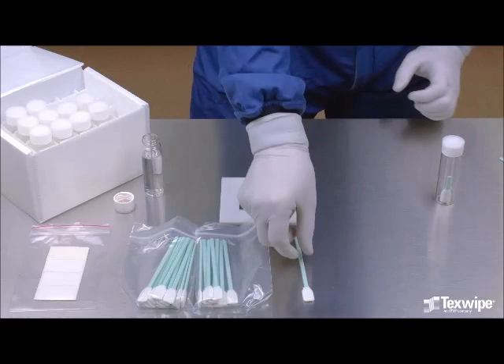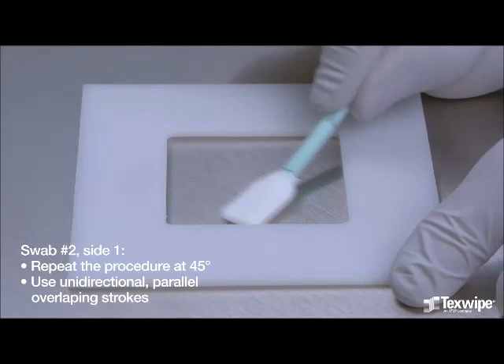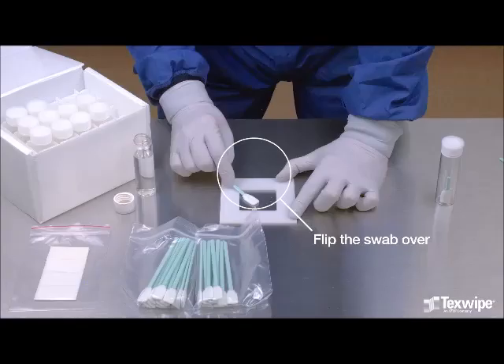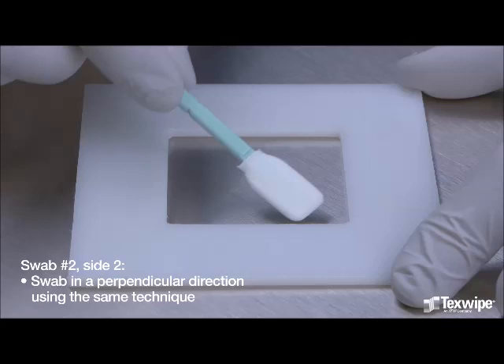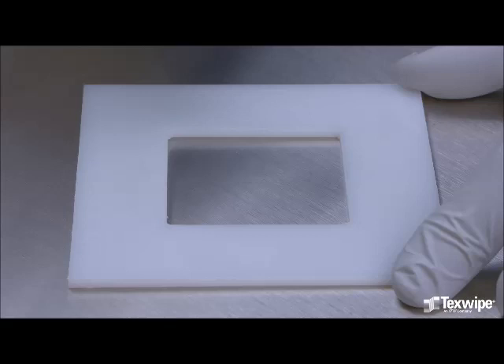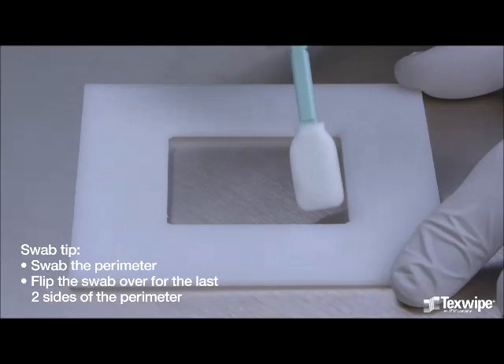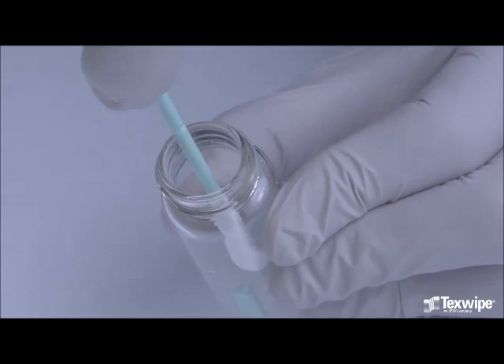Take the second swab, dampen the swab, remove the excess water, and repeat the same sampling procedure at a 45 degree angle. This is the first side of the second swab. Using unidirectional, parallel, overlapping strokes is important for good TOC recovery. Flip the swab over and swab in a perpendicular direction using the same technique, keeping the entire swab head flat against the testing surface. This is the second side of the second swab. The last step is to swab the perimeter of the area using the swab tip. Flip the swab over for the last two sides of the perimeter. Snap the swab head at the notch and allow the second swab head to fall into the same vial.